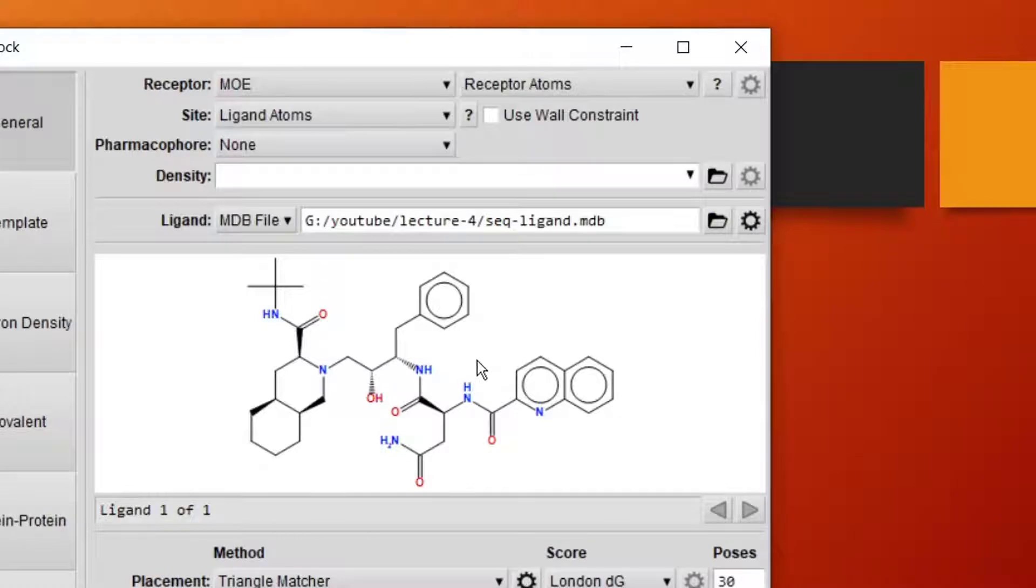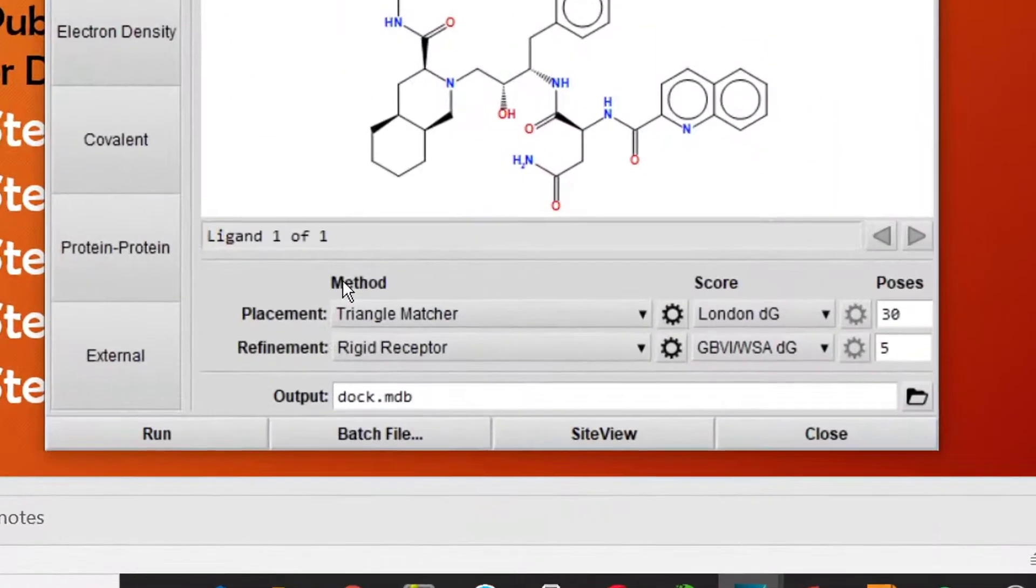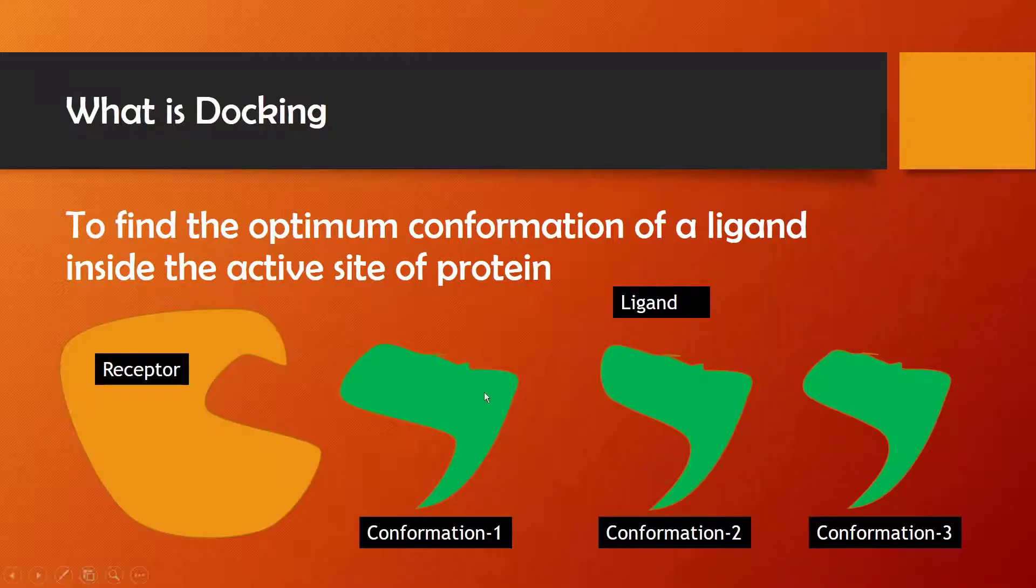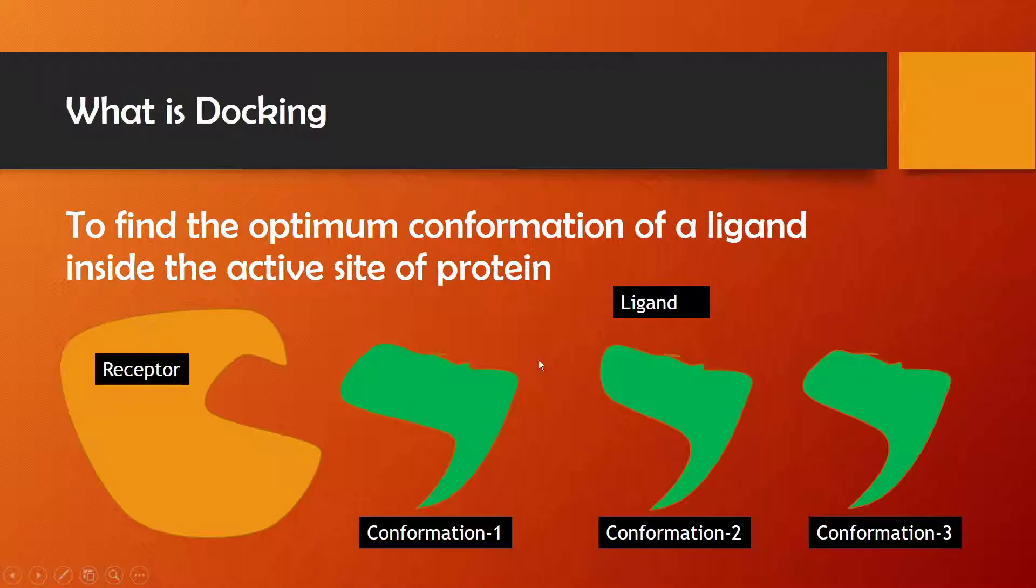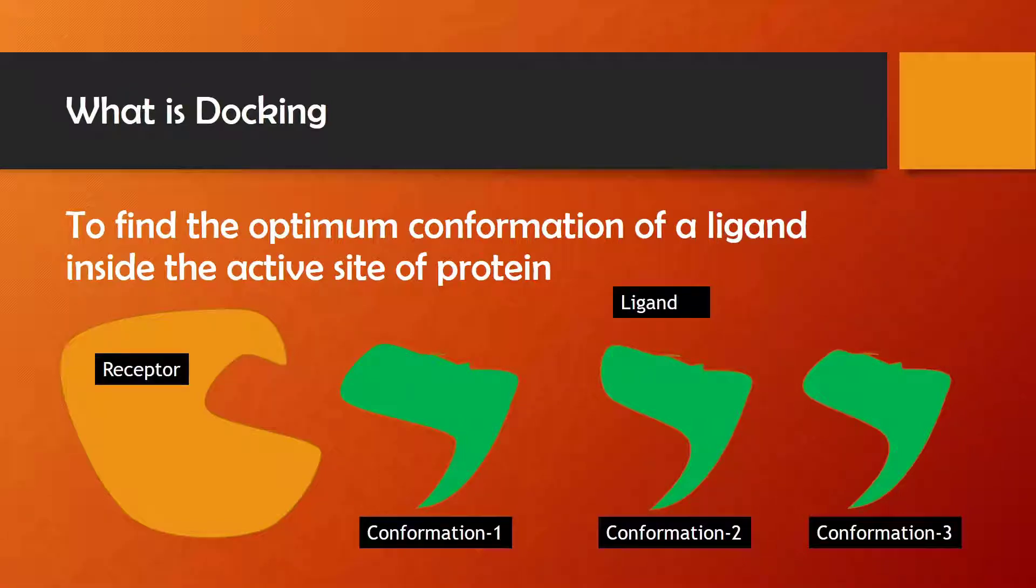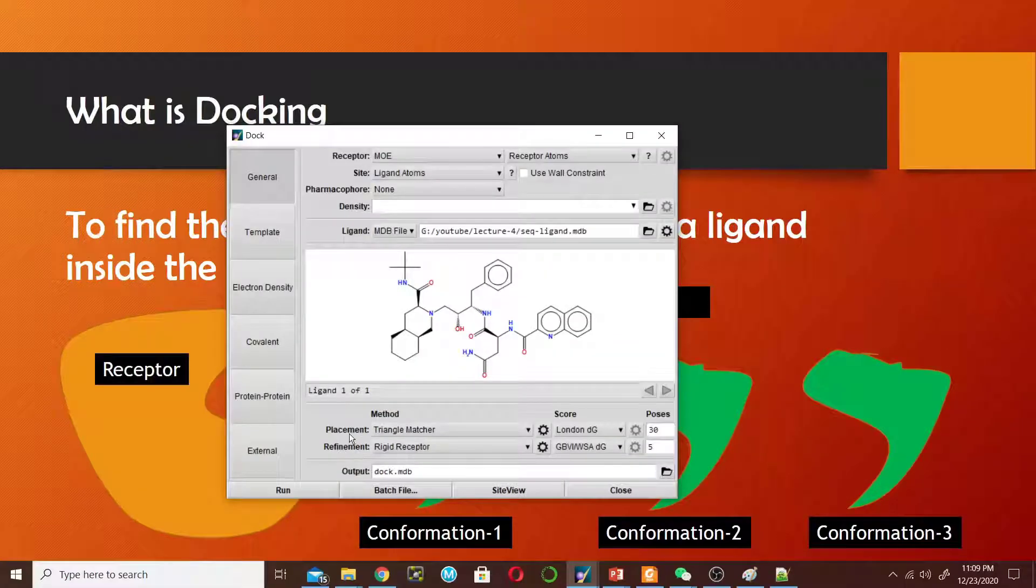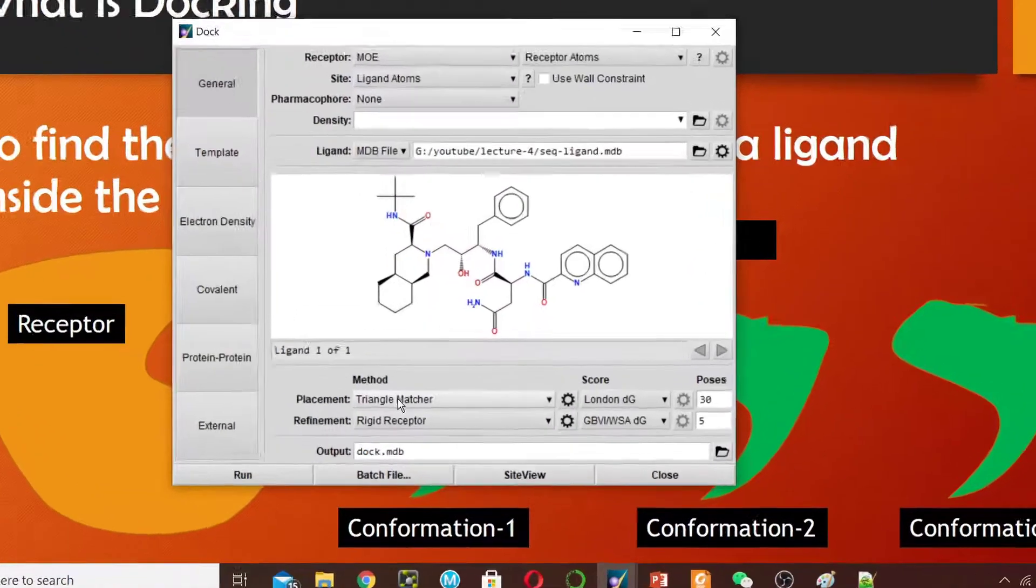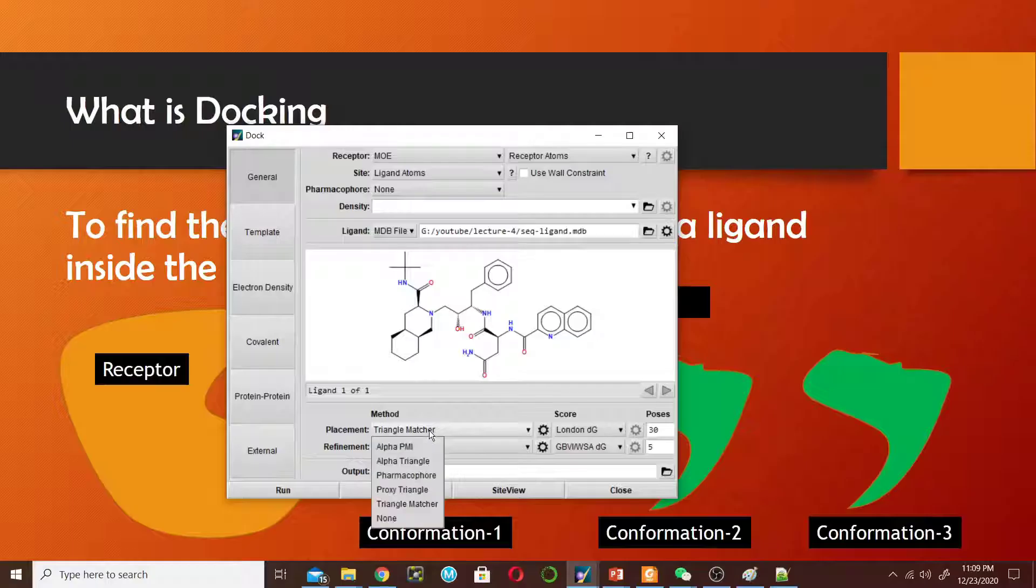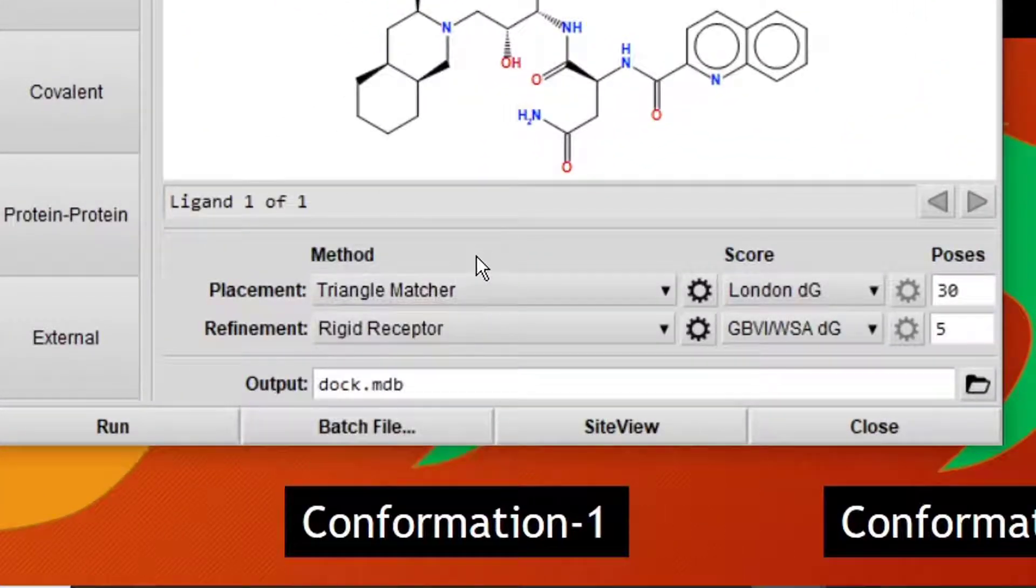Now come to Methods. The Placement - what is placement? I have told you that this ligand has three conformations, so the software will generate these conformations and then place each conformation in the active site. There are different options available for placement method. You can use all these methods and then compare the results and choose the one that best fits your results.